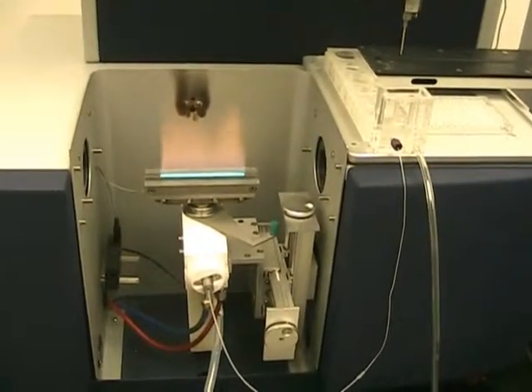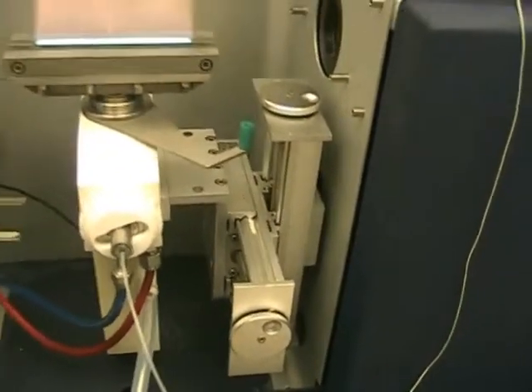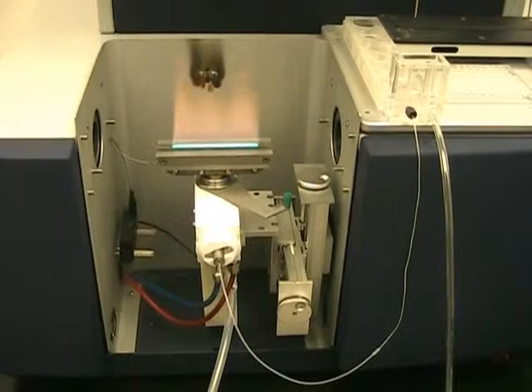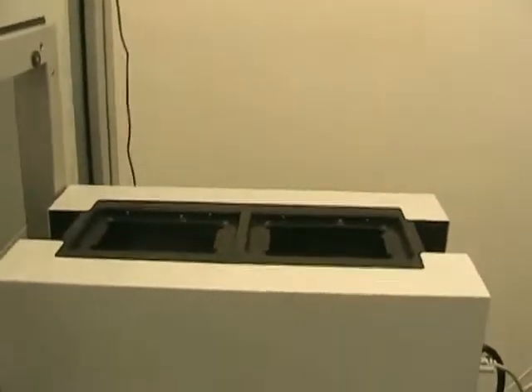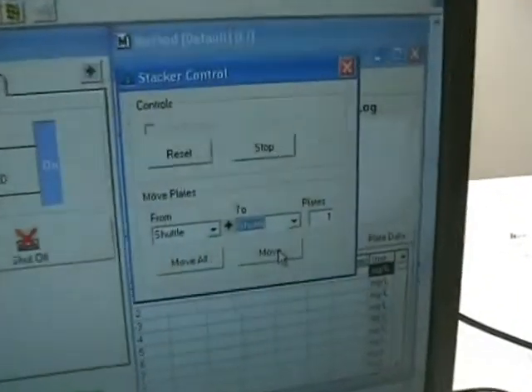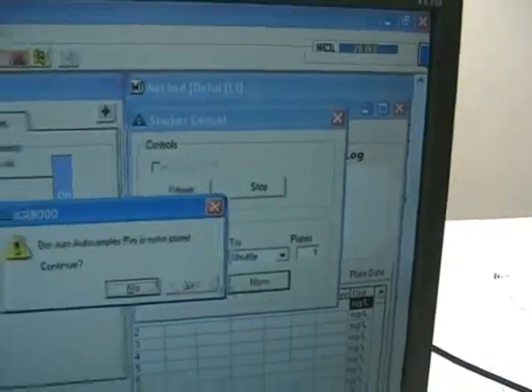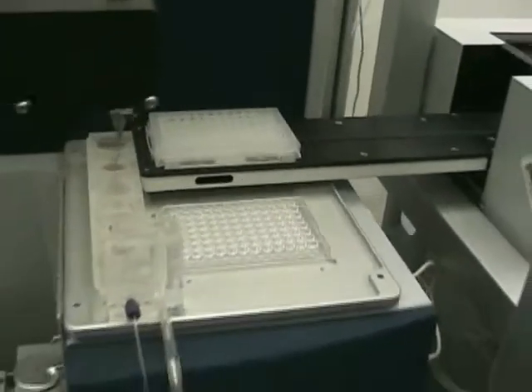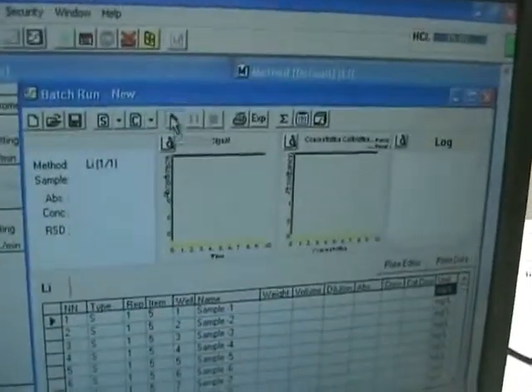The sight glass shoots the best absorbance values possible by adjusting the up and down screws here — these are manual. Aurora does offer an automatic version, but this is the manual setting. Once you have it set, you can always return to that setting by making markings where it belongs. We're going to go ahead and show you the plate stacker — we'll hit the plate stacker move button, which moves the plate over from the stacker into the sample chamber. Then we hit the button to run the sample.